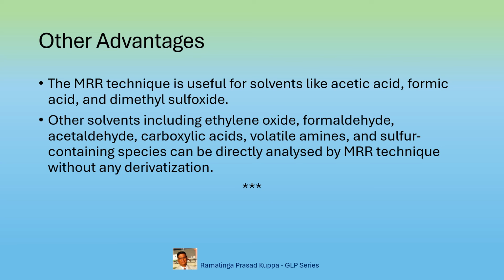This is a new thinking and approach suggested by the USP-NF stimuli article on analysis of residual solvents, that is dated March 26, 2025 and is open for comments up to May 31, 2025. Try to understand and see if we can contribute for the development of this technique.